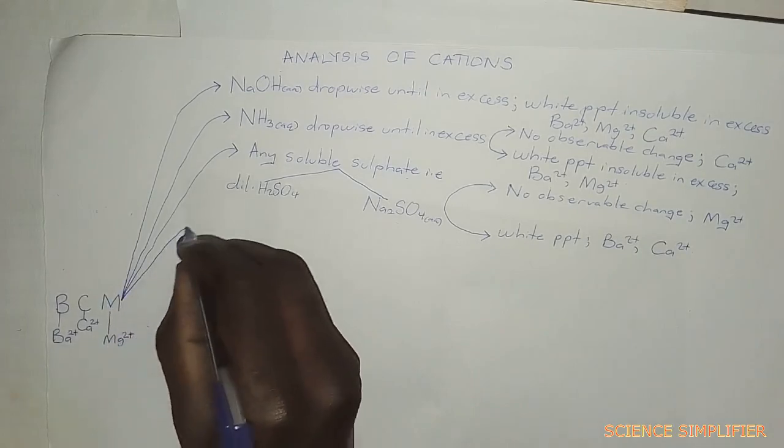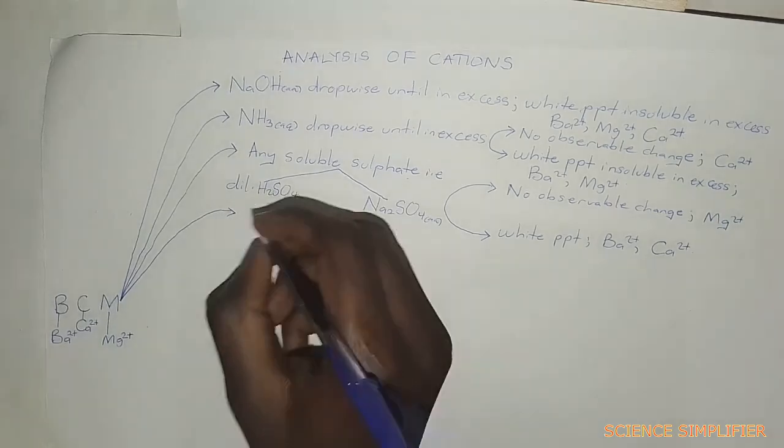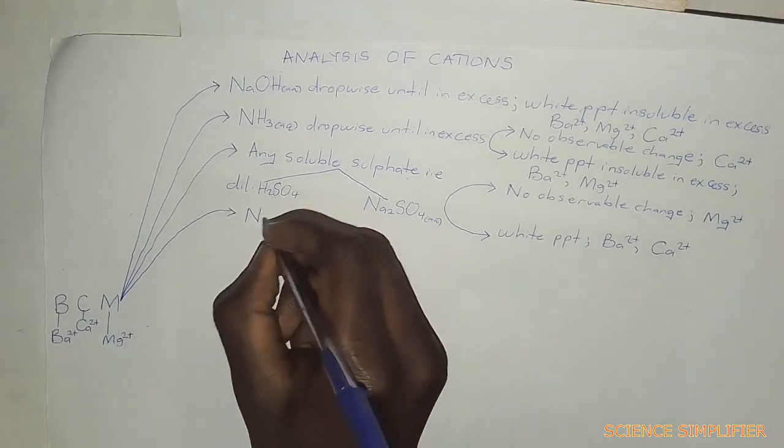Now we can also add sodium hydrogen carbonate solution.